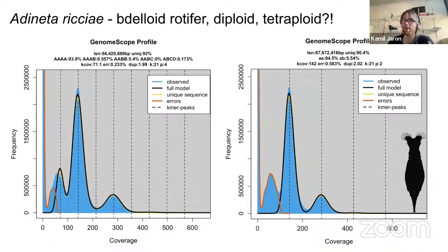We never came up with anything remotely sensible. So the stoichiometry must work to some extent, and you see that there are peaks from 1n up to 8n, and they all look very well spaced, well behaving. But it doesn't make any sense because this genome has only 12 chromosomes, so it can't technically be octoploid.